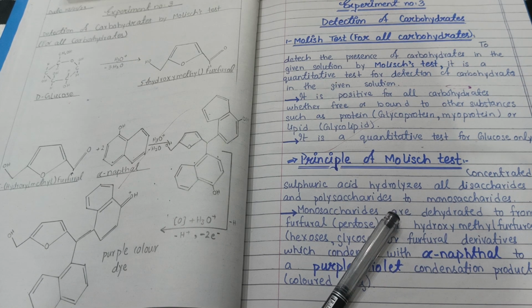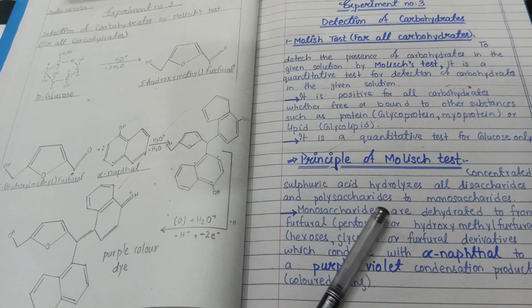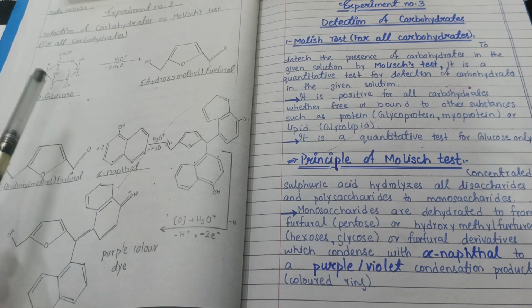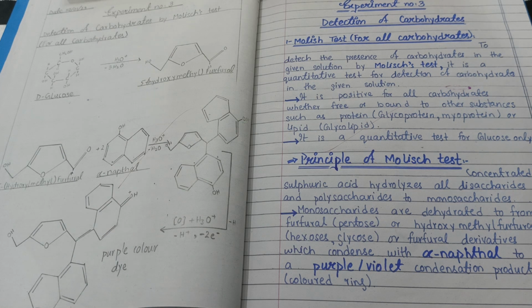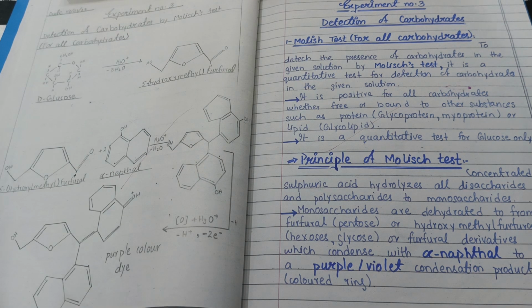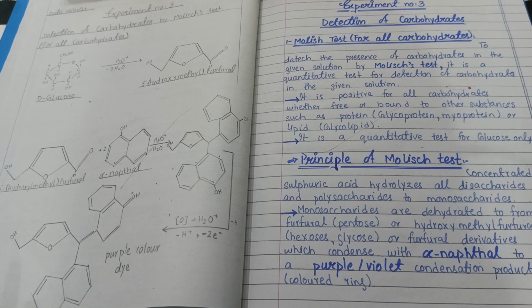For example, if you are given a solution of starch, concentrated sulfuric acid converts this starch into D-glucose, and from D-glucose this process takes place. If you are given sucrose, concentrated sulfuric acid converts sucrose to D-glucose, and then D-glucose undergoes the dehydration process.